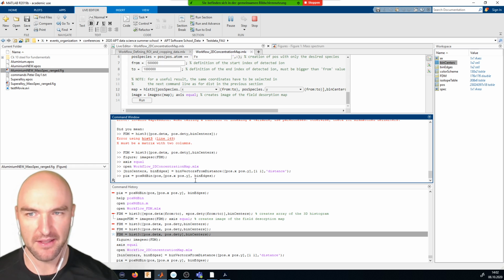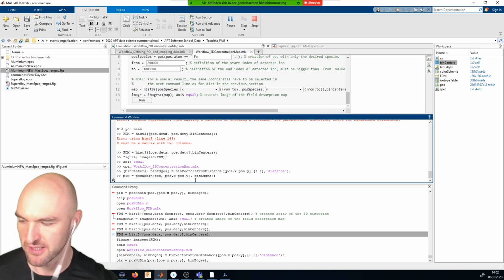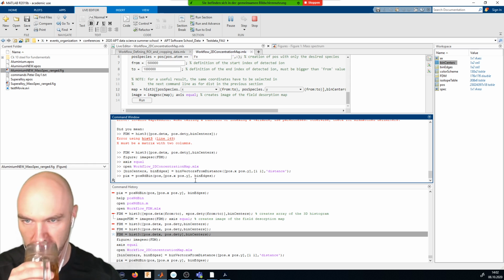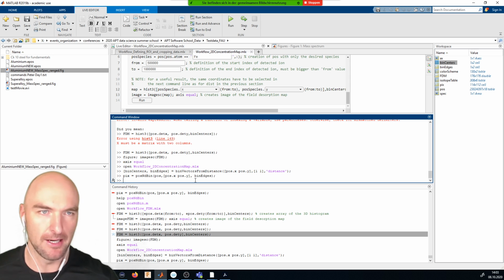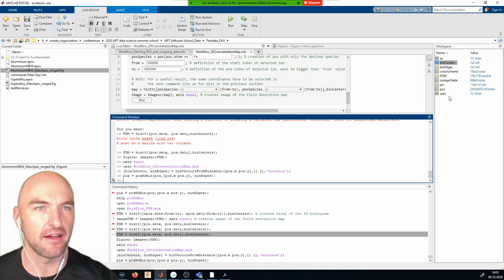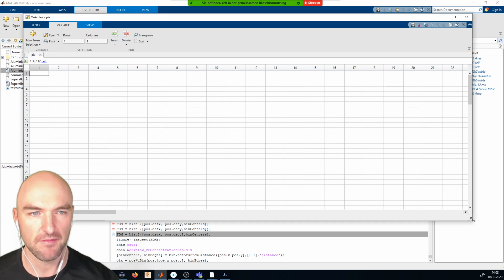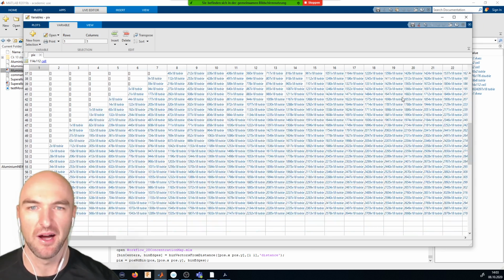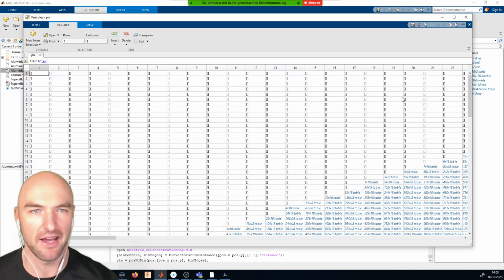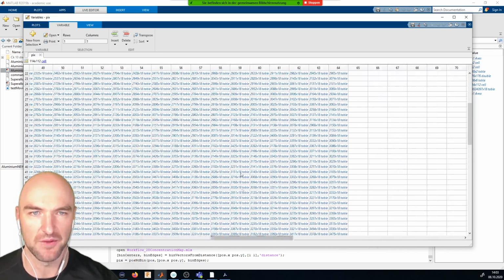And now it divides the entire data set up into small sub-data sets, just like we had with the 1D concentration profile. And now we get a variable that's a cell variable with, okay, apparently it takes a little while to load that, so where you can already see, okay, somewhere in the middle we've got more stuff, and on the side we've got less stuff.